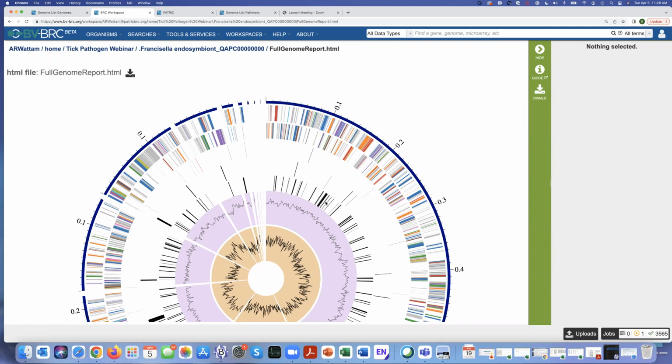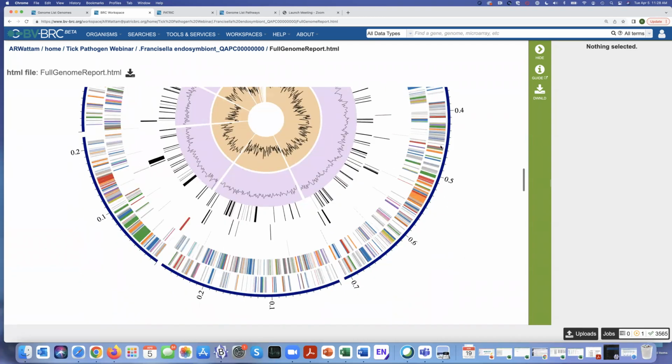Every genome that enters our system is blasted against specialty databases: one for antimicrobial resistance genes, and others for virulence factors, transporters, and drug targets. Because we talk to researchers, these are the kinds of things they're looking for. Rather than making them do this BLAST manually, we're providing that for them.